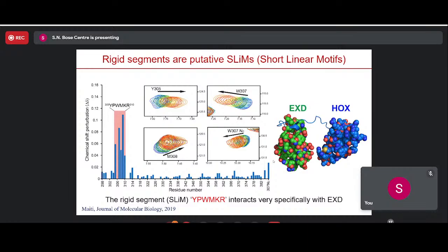And then when we titrate this other protein, which is unlabeled, so it's invisible in the NMR spectrometer, the residues which are interacting, they actually shift like this. Okay. So when we see peak shifts like that, we know these are the residues which are interacting, and the residues which do not interact will not shift. They will stay right at the same place throughout the titration.